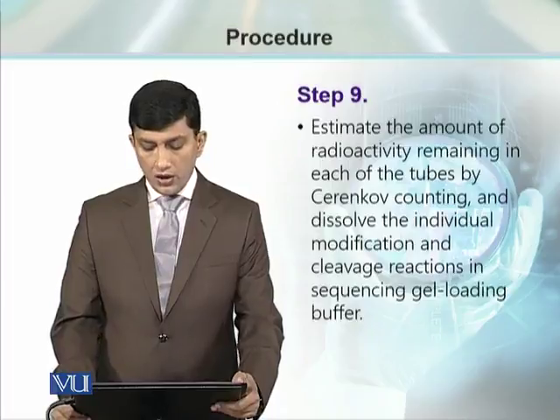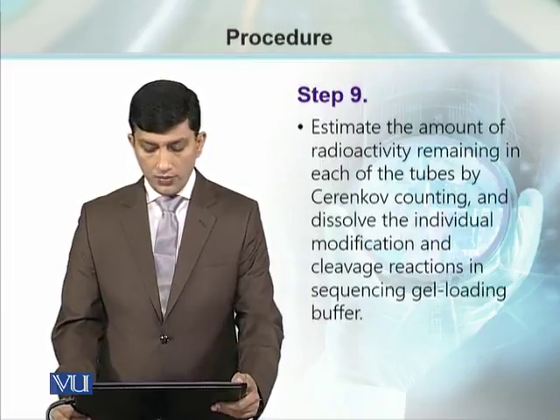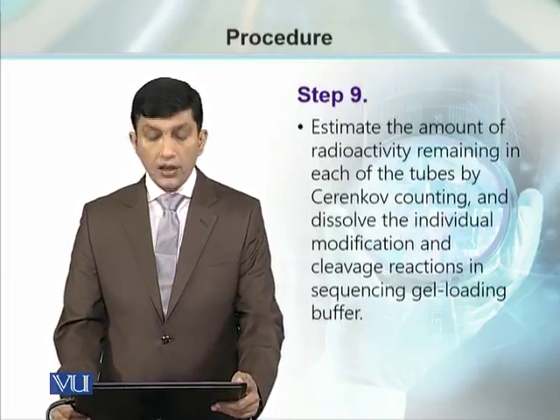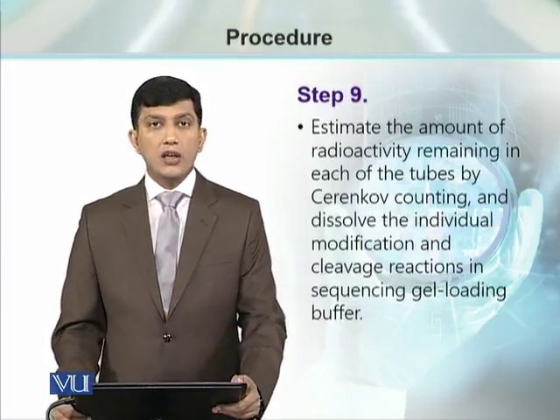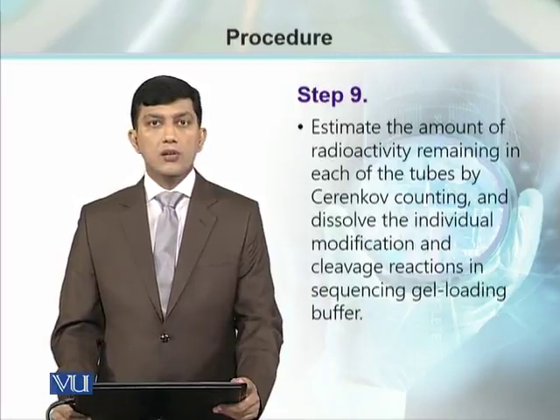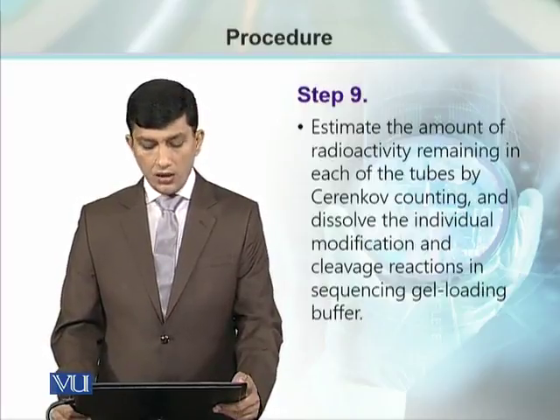That is a Cerenkov counting apparatus, handheld.